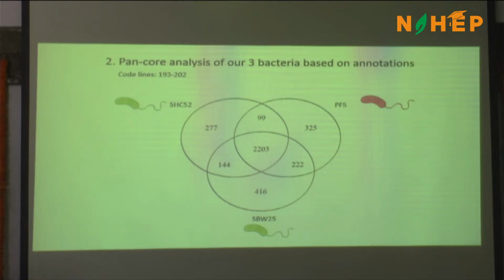Okay. Really good. So yes, 144. Here we have already a small number. Well, small, it's still over 100, but we have 144. So in lines of the code 193 to 202, if you run that, you click the play, you will generate this plot. Okay, so let's try to do it.